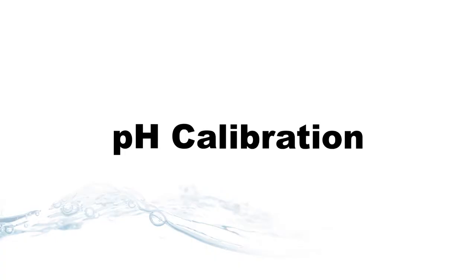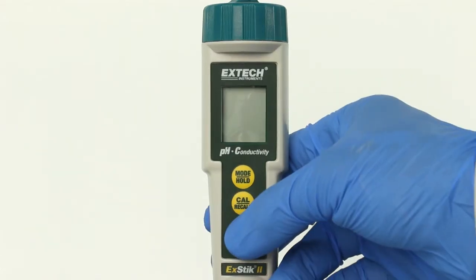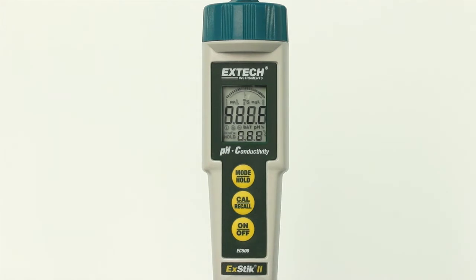pH calibration. For the most accurate calibration, make sure the calibration buffers are at 25 degrees Celsius, as the temperature compensation is not active during calibration. Press the ON button. Self-Cal will appear in the display during the turn-on diagnostics.